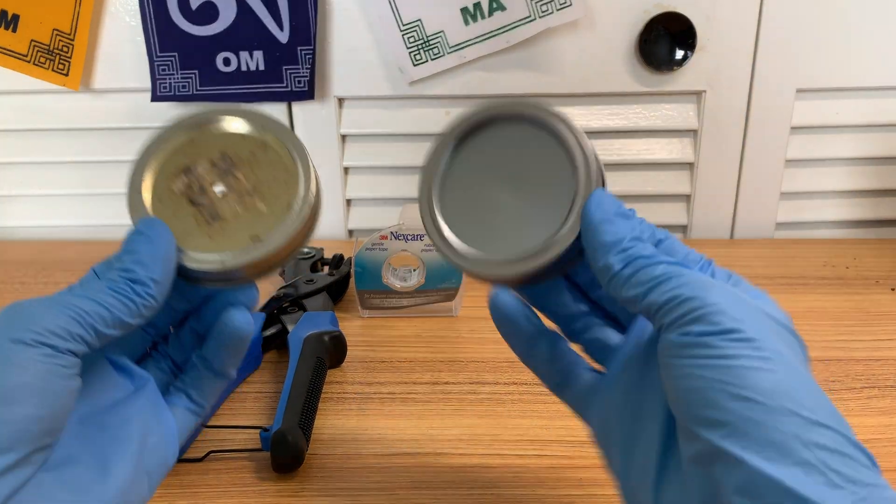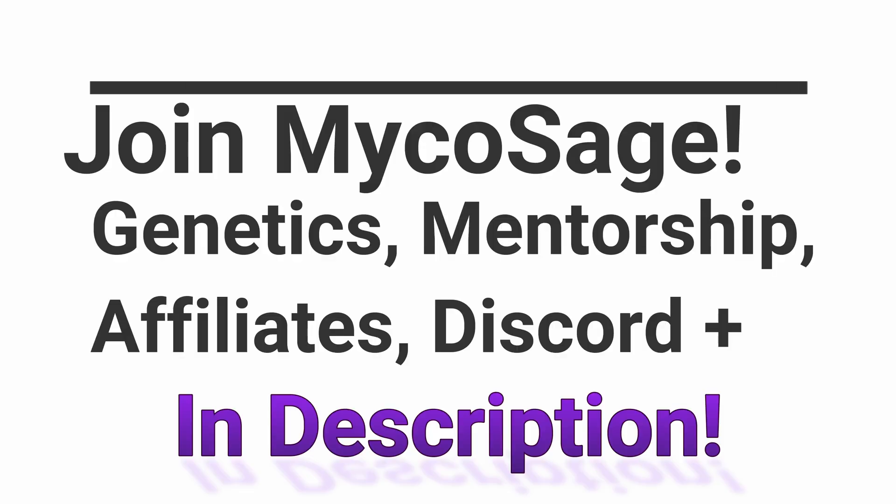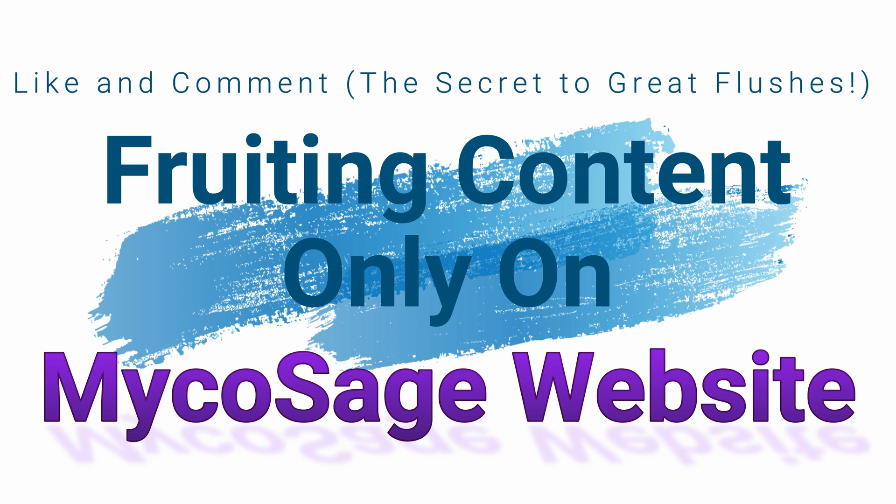What are grain jar lids? What do they do? Which one's best? Modified or unmodified? This is Michael Filesage checking in here today, and in today's video, as I said in the introduction, we're going to be looking at grain jar lids.